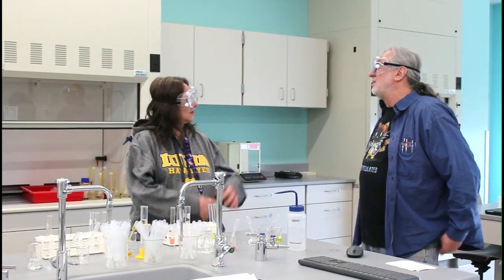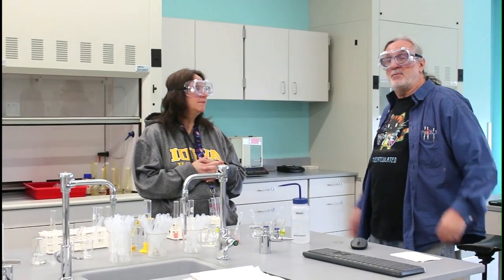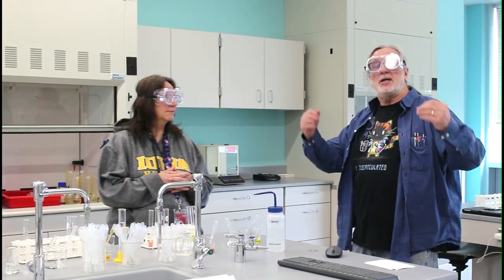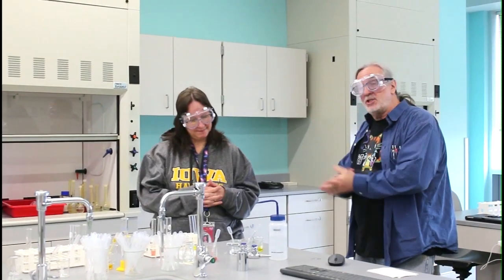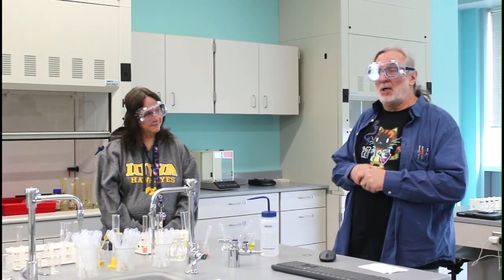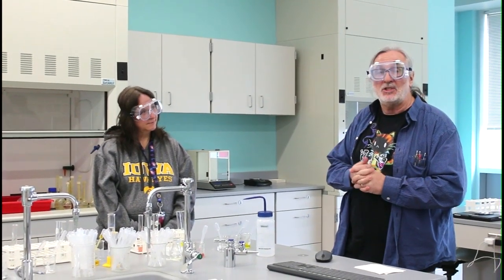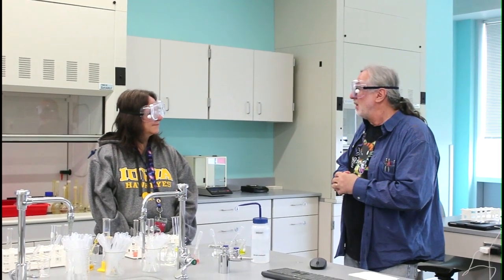For the write-ups, they just need to discuss what you saw. There are no calculations or quantitative parts, just what you saw, and explain what's happening in terms of Le Chatelier's principle. We have systems in dynamic equilibrium, and we're going to put a stress on that system. A lot of the stress is going to be adding or removing a species, maybe a reactant, maybe a product. We'll also, with the cobalt(II) chloride equilibrium, look at effects of temperature and such.